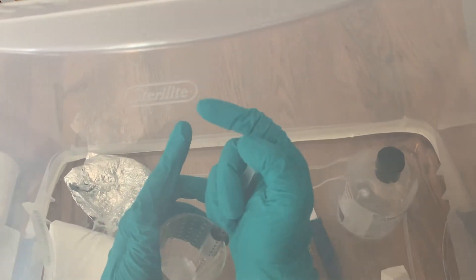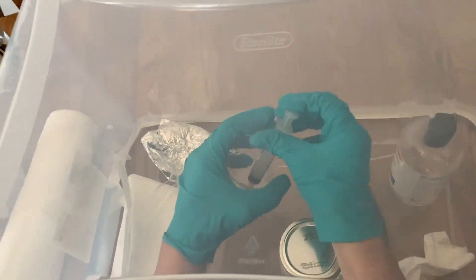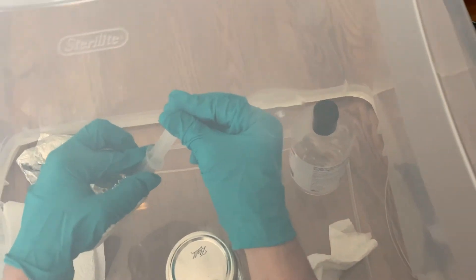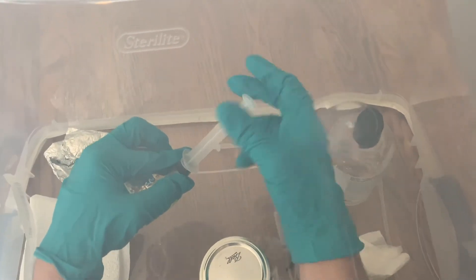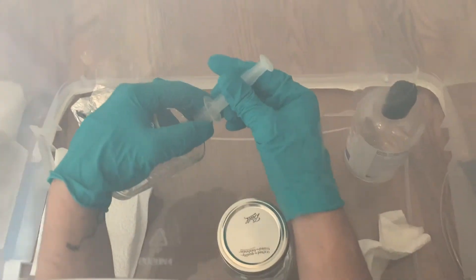On the last draw up, make sure there are no air bubbles in the syringe. You can tilt it upward and push out the air through the top, and then put the black cap onto the syringe. Then you can store it or use it immediately.